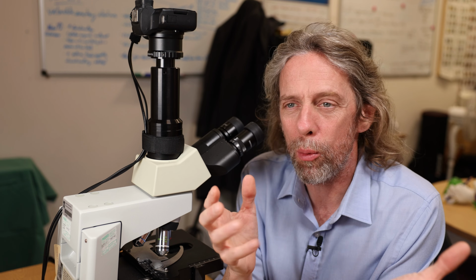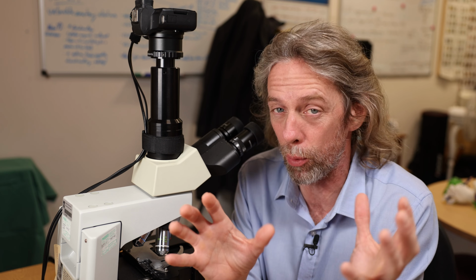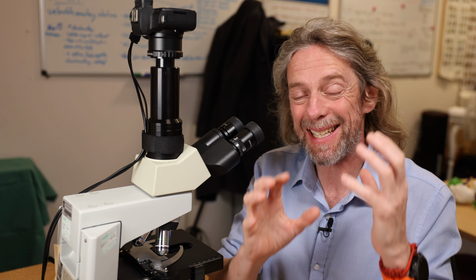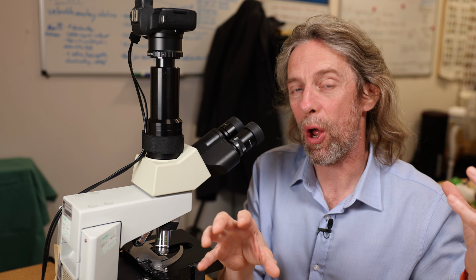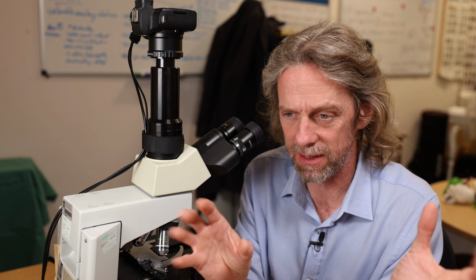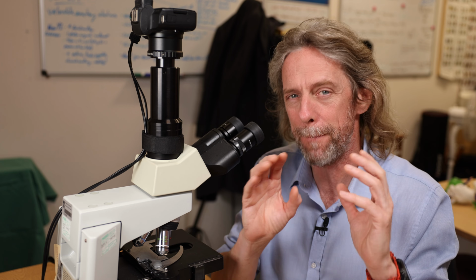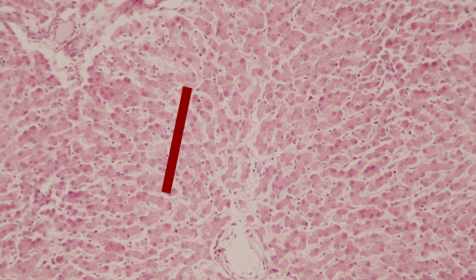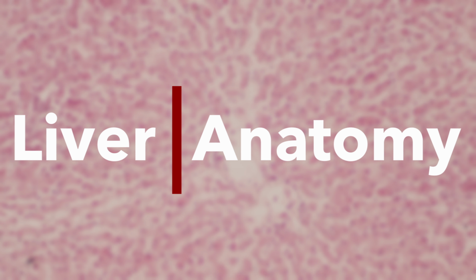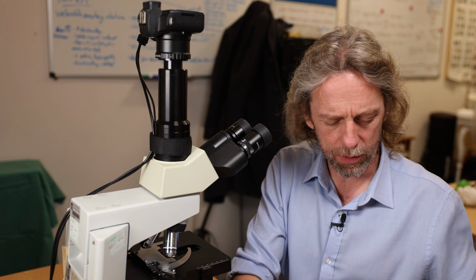It does so much work, the liver, that I'm not even going to try to explain all the things that it does. But let's have a look at the cellular arrangement of the liver, because it's a common thing in most anatomy syllabuses, and it seems complicated when you first look at it, but it's not. It's quite logical. I've got a bunch of liver slides actually, but I think we're just going to look at two of them.